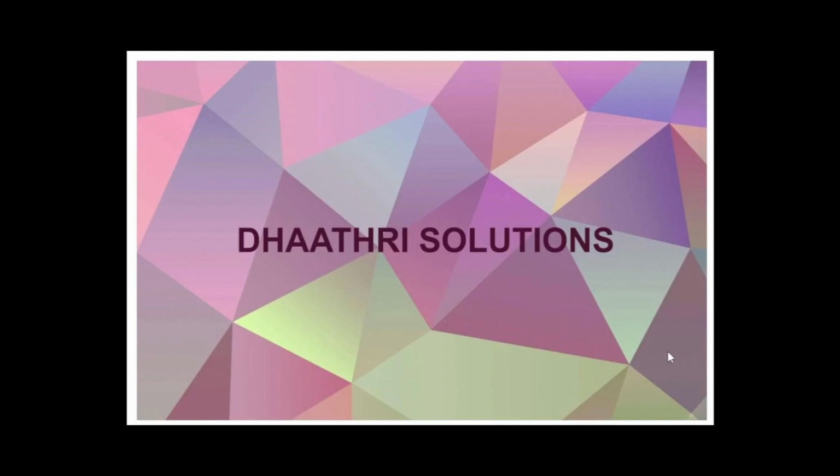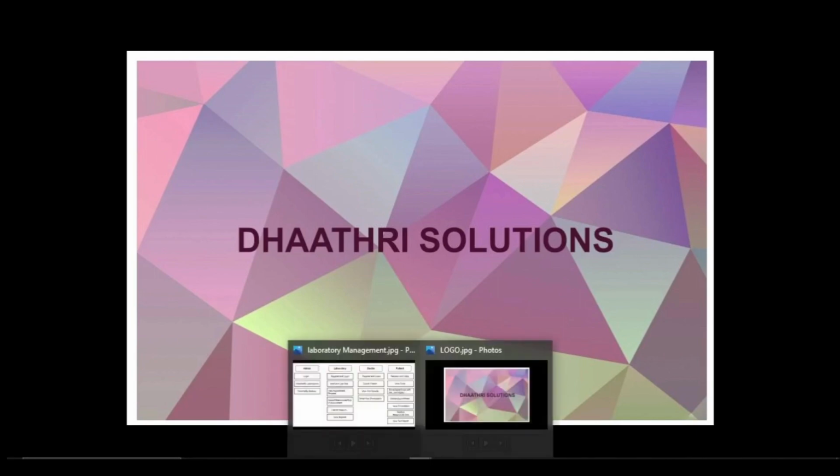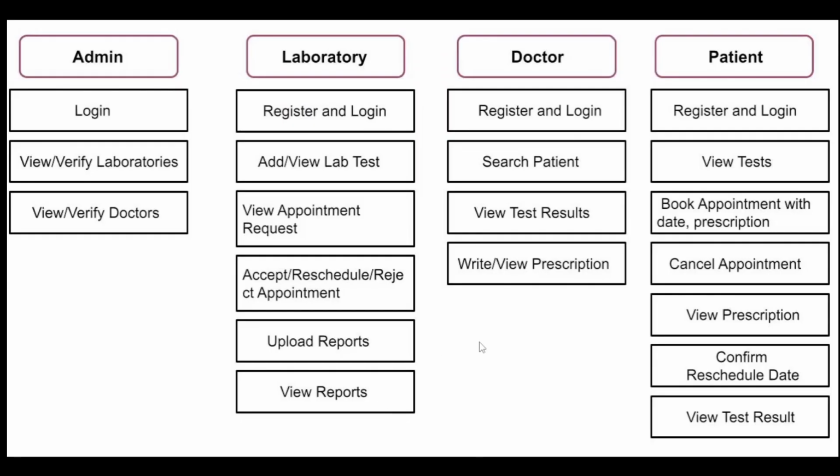In this website, the patient's test results, test appointments, and the prescription given by the doctor for the issue, everything will be saved, so that the patient can have complete knowledge about the progress of his health. This is an amazing idea that keeps the health records of our patients. So let's look at the flow diagram once so that we can have a good understanding of this website.